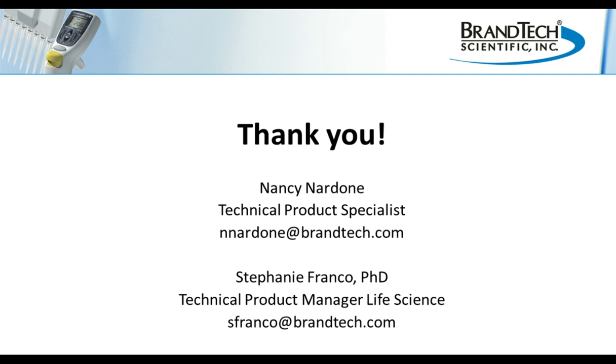How does automation save me time? Well, automation, I would say, has its benefits. A robotic process is certainly going to require time investment up front. Also, during an actual robot procedure, the robot may not handle liquid handling as quickly as an actual person. So the time savings that you're going to experience are going to be when you are actually freed up from sitting at your bench pipetting the same amount of liquids over and over. You're going to have the opportunity to do other things in your laboratory. As I said, maybe it's data analysis or working with some other sort of experiments. So, again, considering from a time standpoint, it's really going to help you with your consistency and your reproducibility of experiments rather than cutting seconds off of a pipetting protocol.